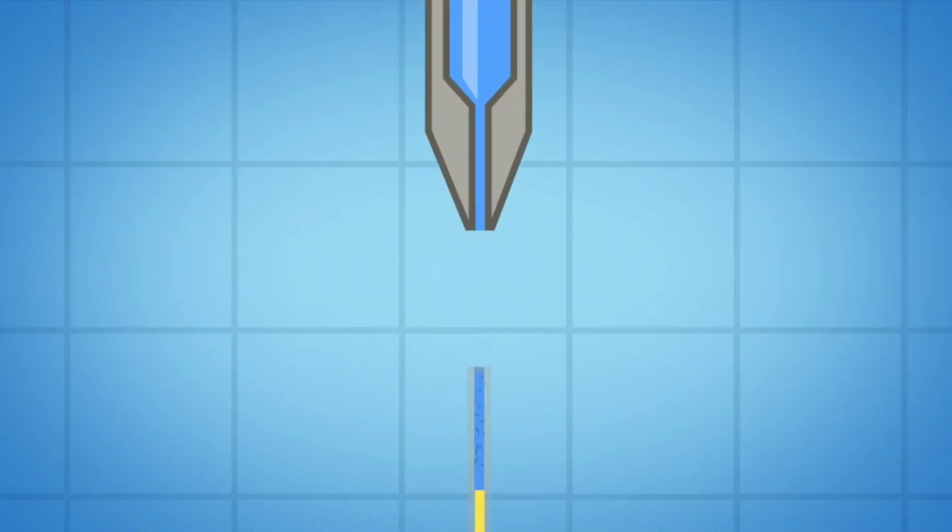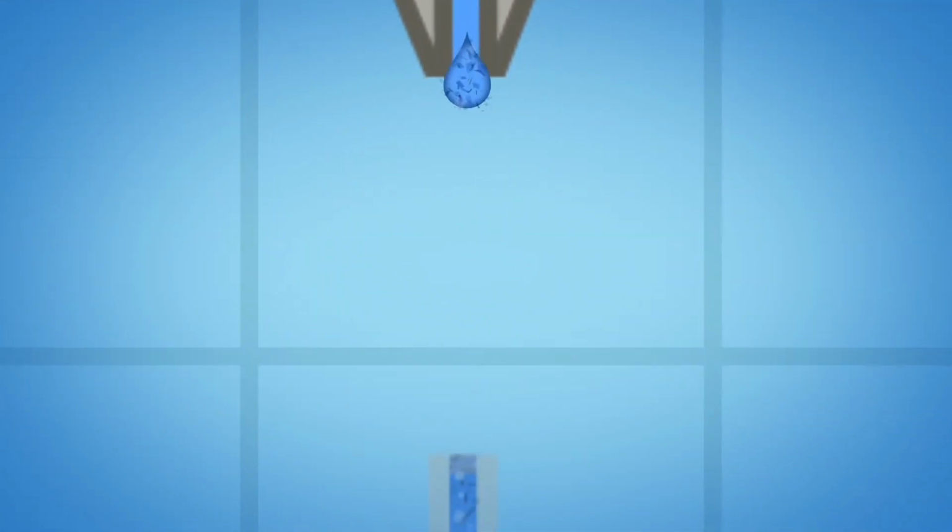When fully filled, the droplets continue to eject, now onto the solvent surface of the concentrated solvent in the tube. As the droplets contact the solvent surface, the volume of the solvent exceeds the volume of the tube and results in the solvent cresting upward, forming a meniscus. The meniscus extends into the atmosphere where it evaporates, leaving the analytes free in the solvent.